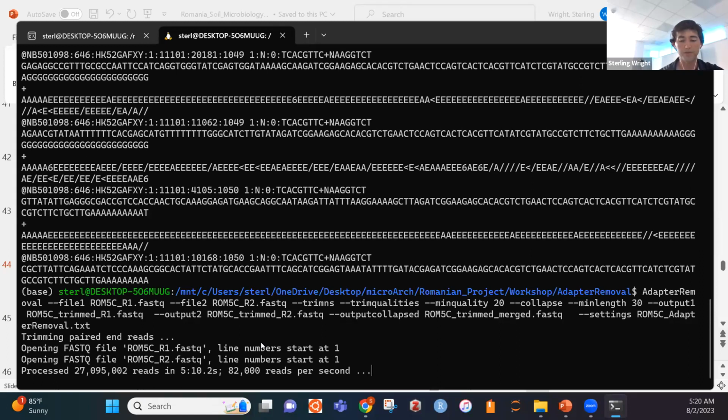If you have experience with amplicon sequencing and you're thinking about going to shotgun sequencing, to me, that's one of the biggest differences between the two types of data sets. Whereas with amplicon sequencing, a lot of people can generally do the analyses on just a basic laptop, for shotgun metagenomic analyses you're usually going to require some sort of high memory supercomputer to be able to perform everything that you need.